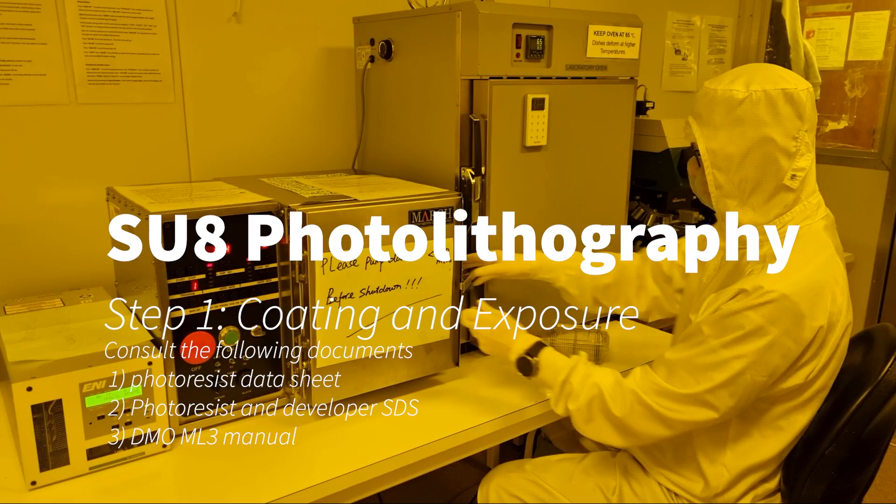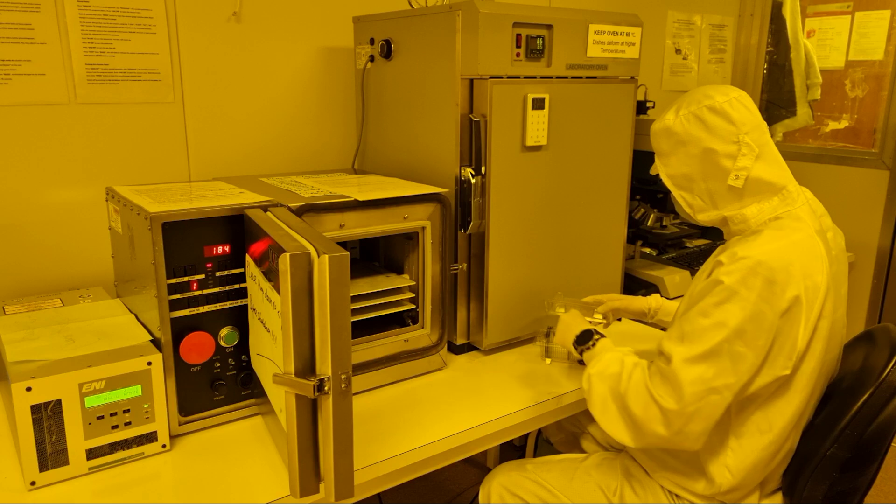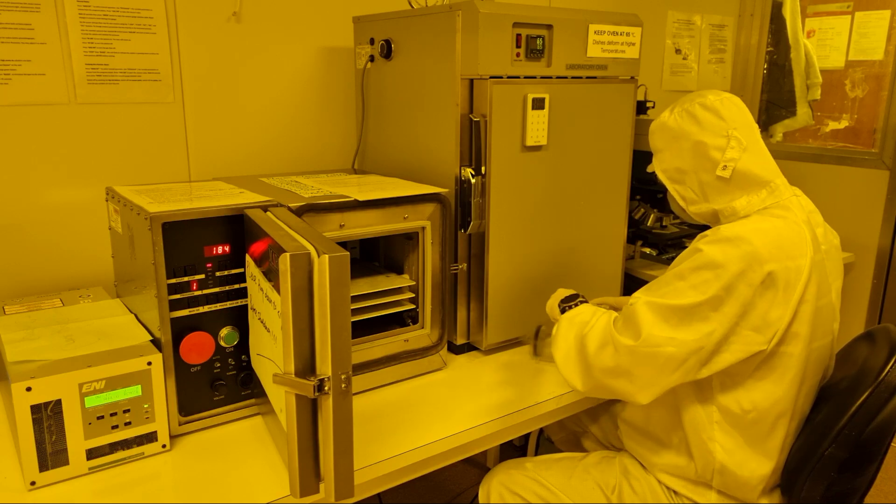This is the first of a two-part series on SU8 lithography in the Macquarie University cleanroom. This video will cover the first layer and its exposure.